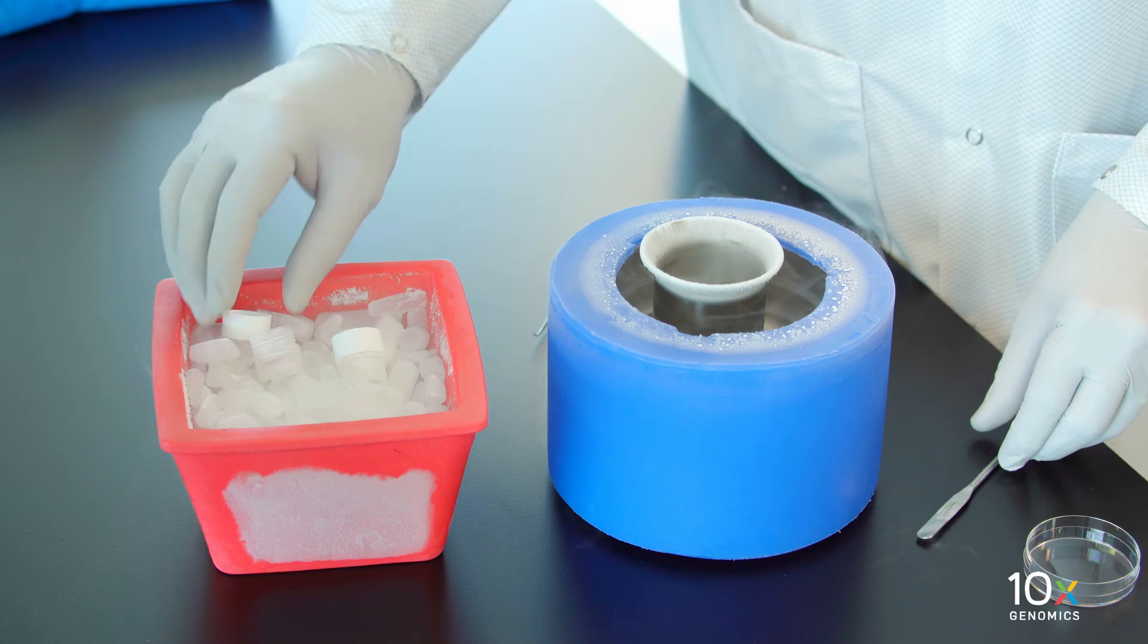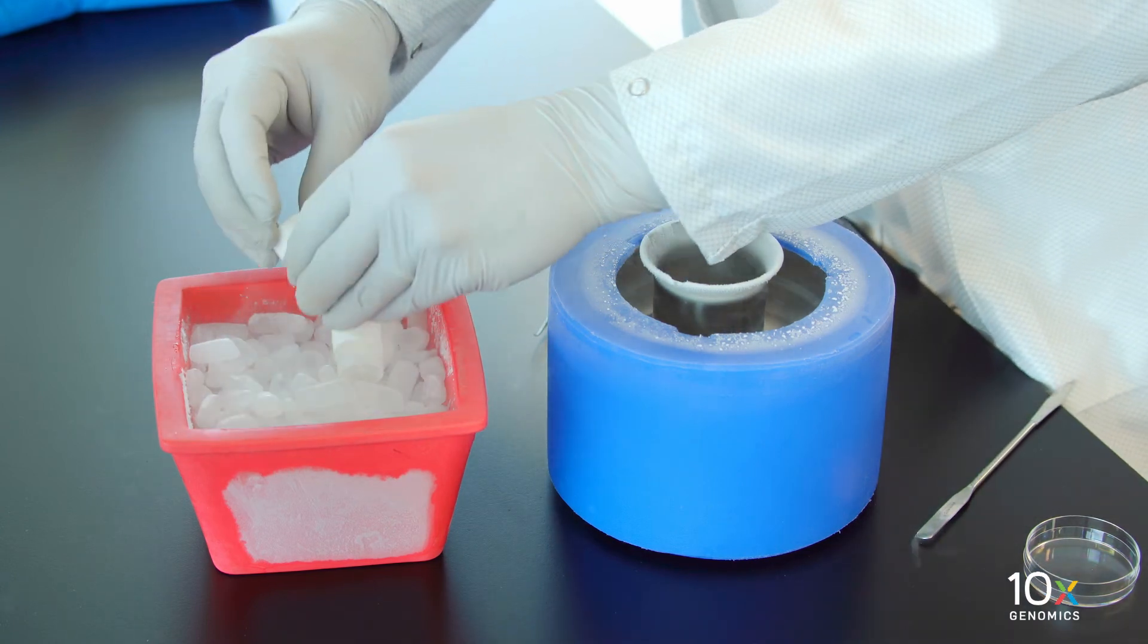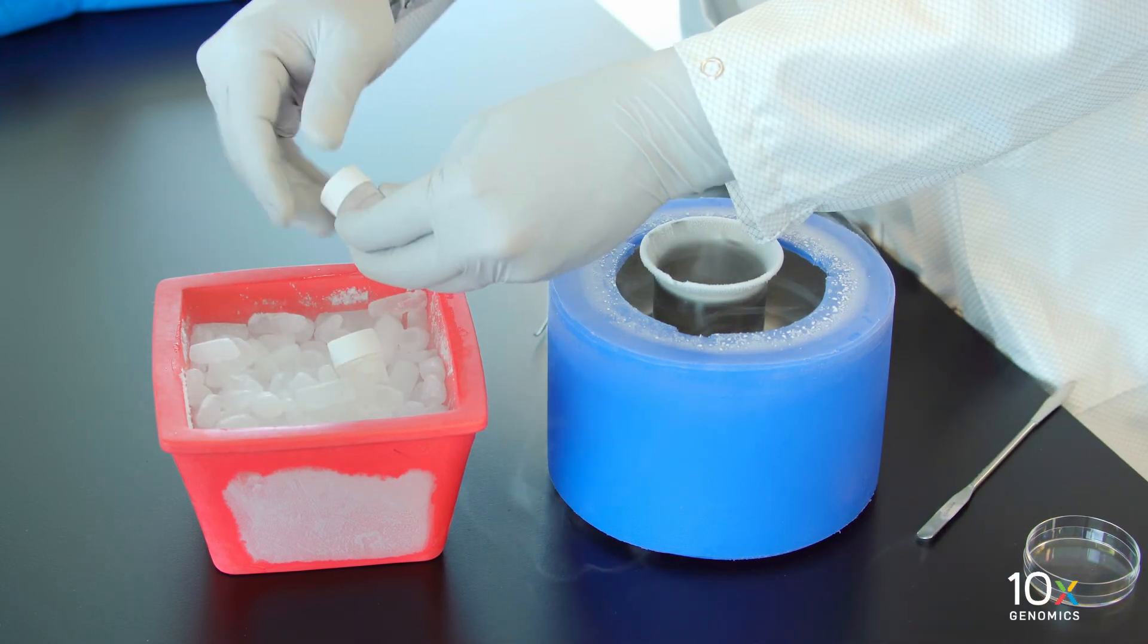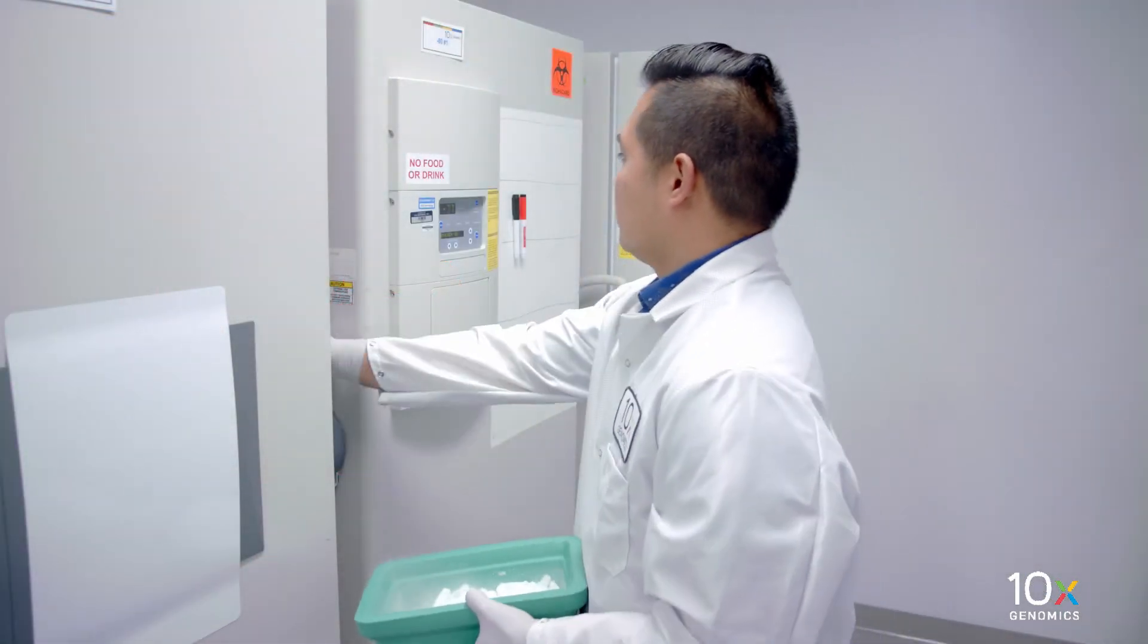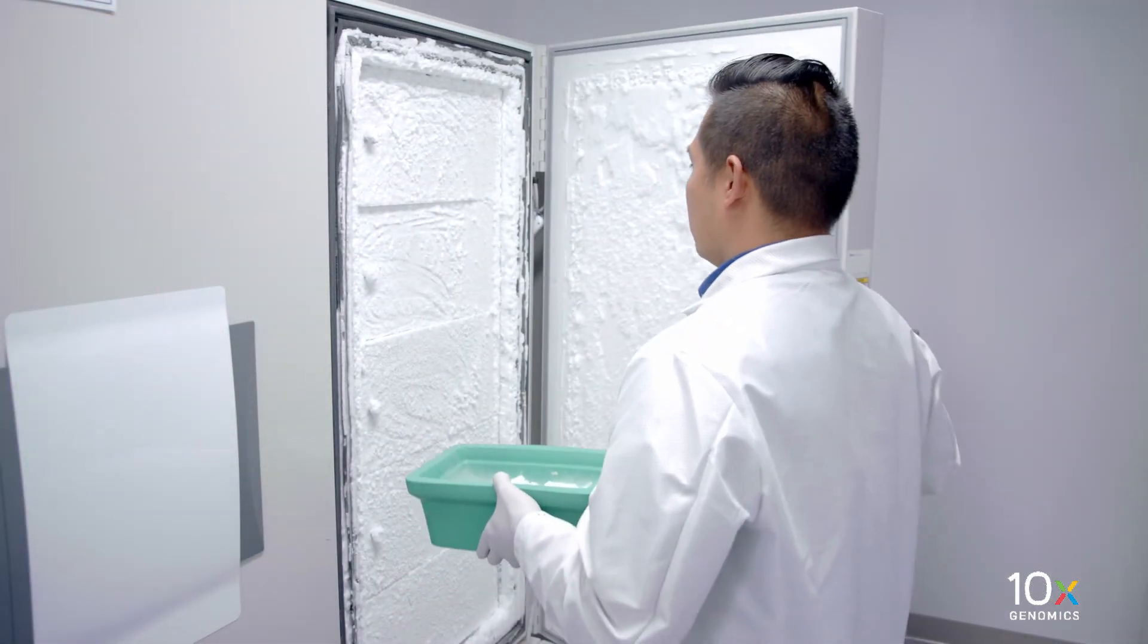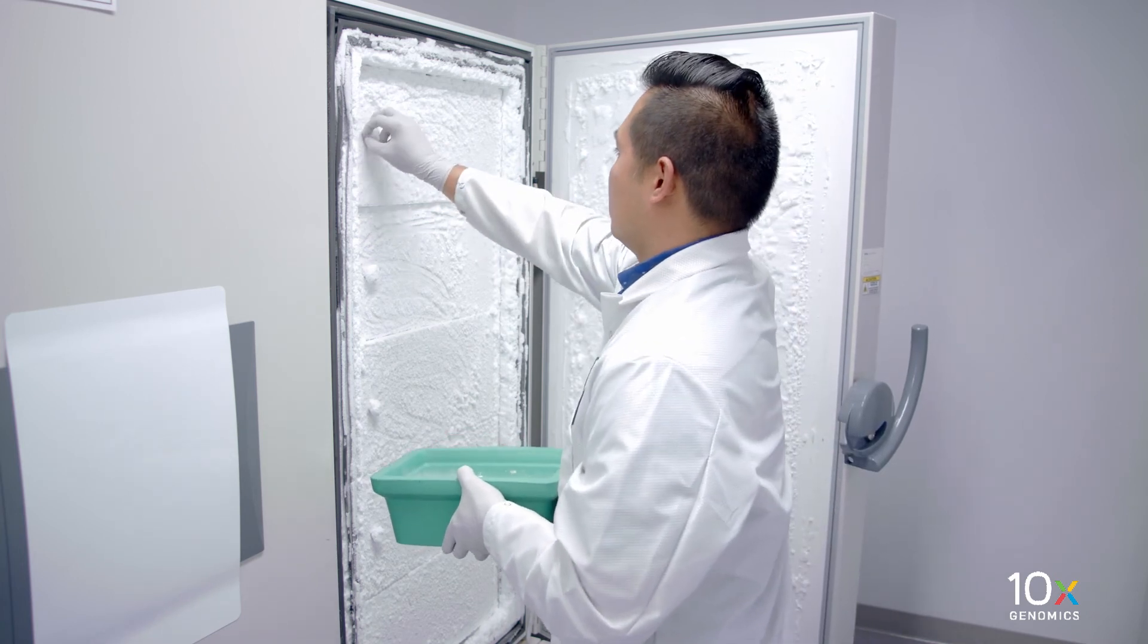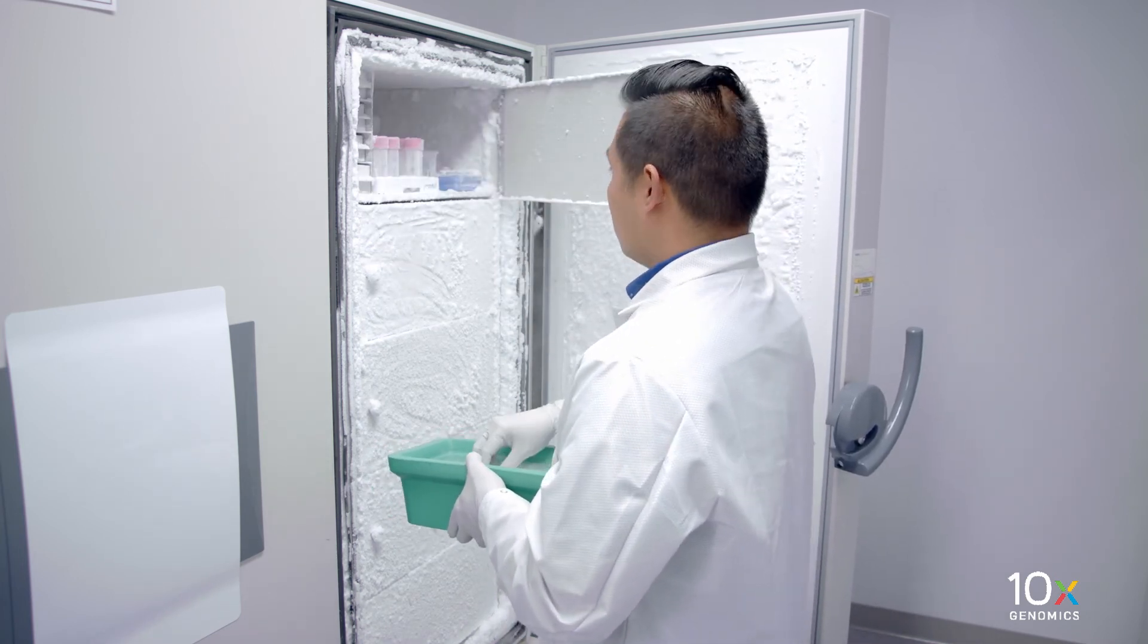To prevent evaporation and dehydration of the tissue sample, snap frozen tissue sample must be stored in a sealed container. Store frozen tissue at minus 80 degrees Celsius for long-term storage or immediately proceed to frozen tissue embedding.